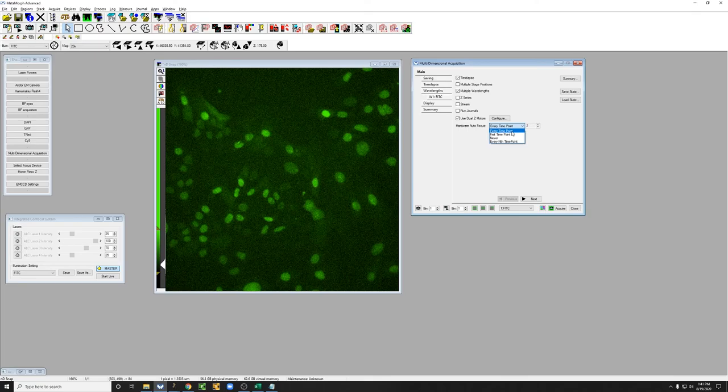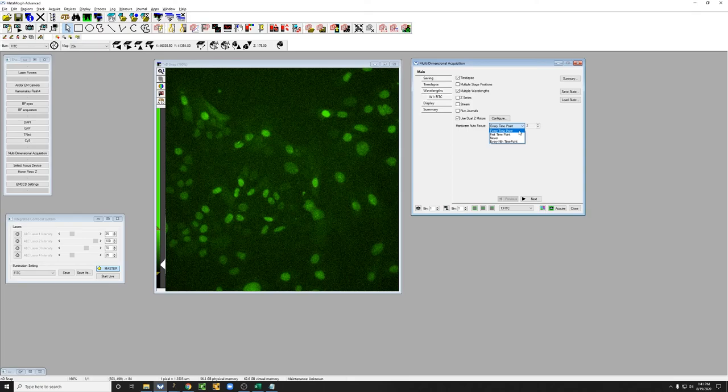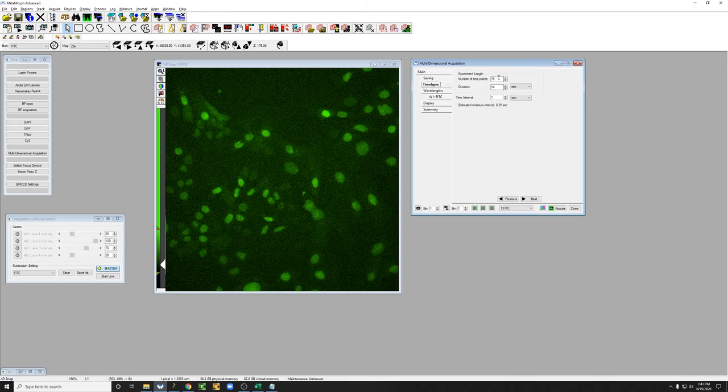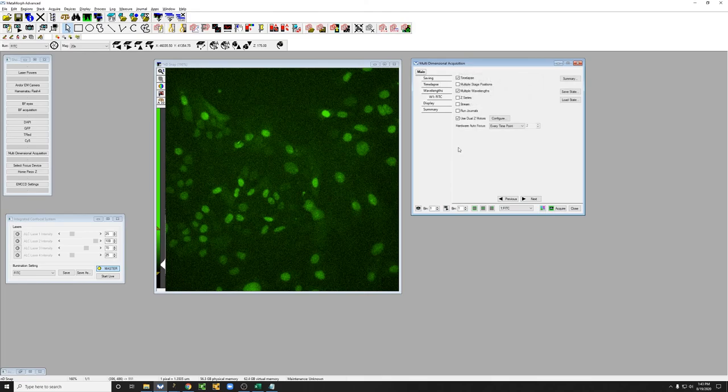If we were taking time points very close together we might want to do every nth time point, but typically if you're going every few minutes it's a good idea to just do the hardware autofocus every time point. If we go back to time lapse, I've modified this off camera to have a one second interval between images for a total of 15 time points.